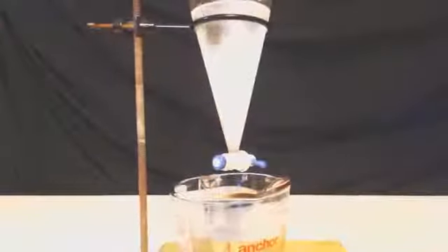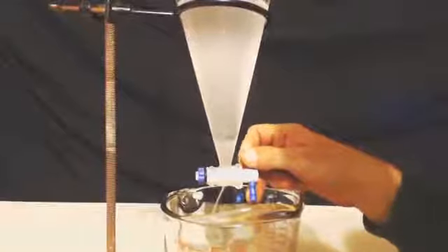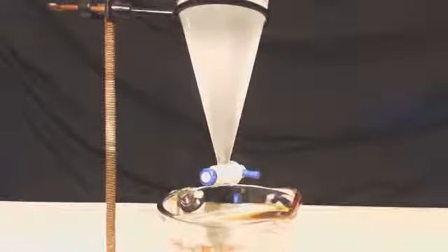Do it a third time. Put a little bit of water in there. Shake it up. Let it sit 20-30 minutes at the very least. Then I'm going to drain that out. This time, though, because I've been putting water in there, I'm going to put some salt water in. That's really polar. Get some of that water out of there.